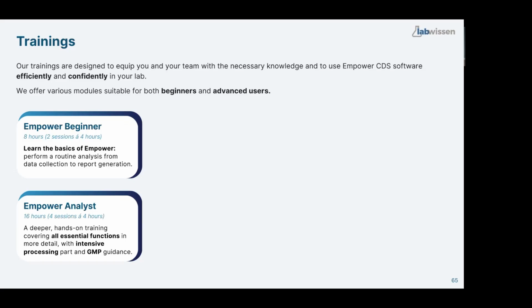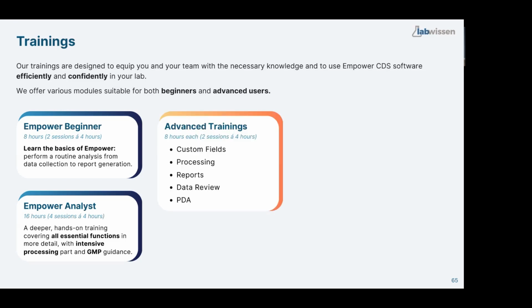We learn how we perform analysis from data collection to report generation. But Empower Analyst has a more intensive processing part, a more intensive reporting part, and a little bit of data review. So it's more in the GMP direction. Then we also have advanced trainings like custom fields.